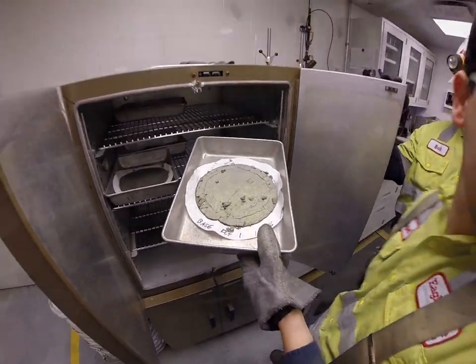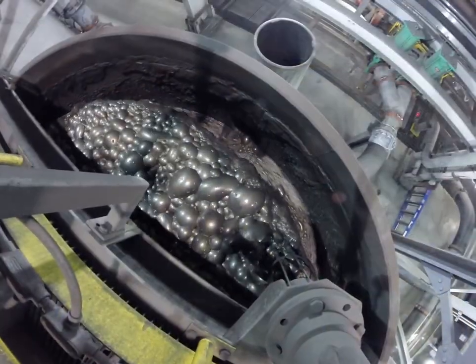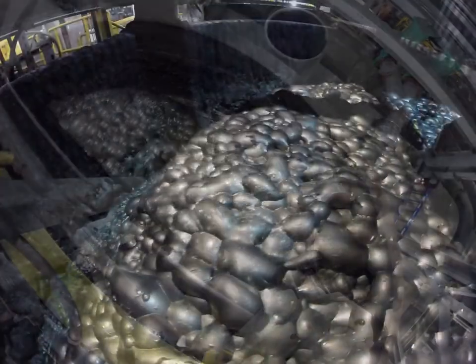It's really cool. There's a lot of interesting things going on here on a very large scale in the mill, and this is a smaller scale of what's actually happening inside the plant right now.